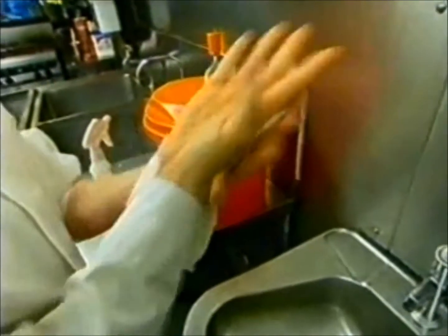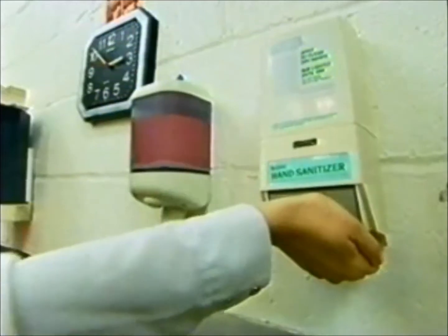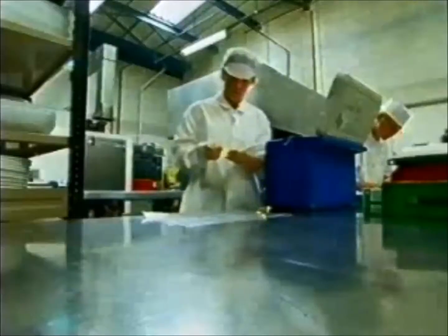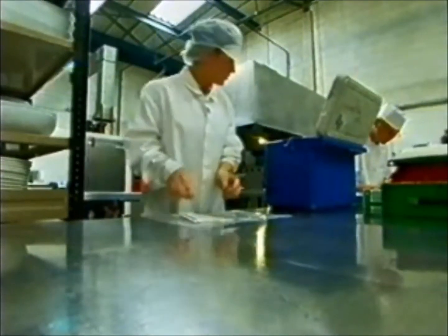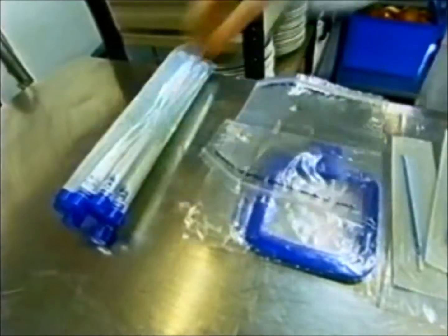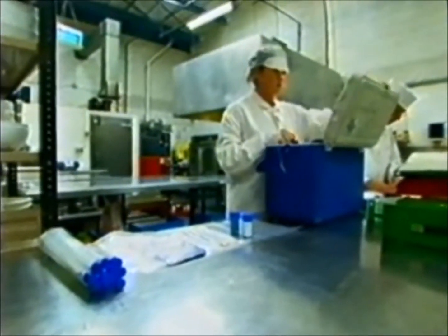Always wear protective clothing. Always make sure that you've washed your hands before carrying out any sampling. Always use clean, sterile sampling tools — if you're going to use a scoop, make sure it's a new one; if you're going to use a sampling pot, make sure it hasn't been opened previously and the seal hasn't been broken. Always make sure that you have a clear aim in your mind as to what it is you're sampling for and why you're sampling.